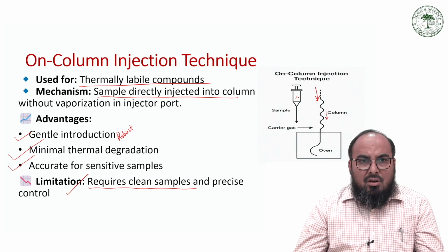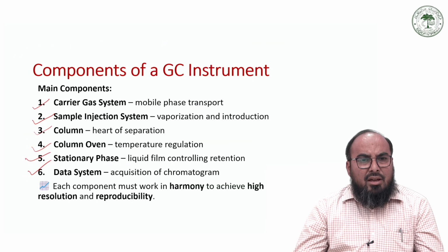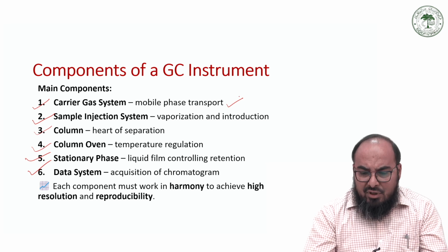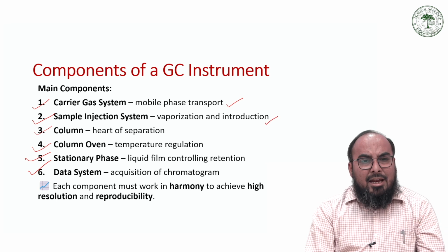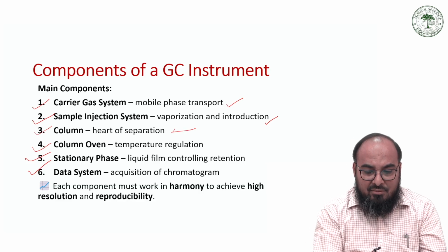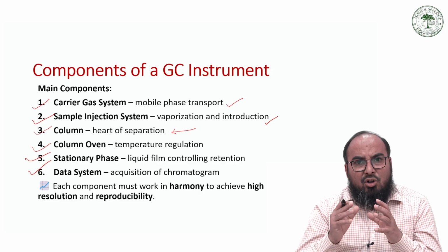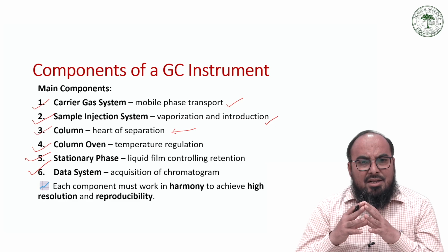Now, we have covered the carrier gas and the sample injection system, and now it's time to strike at the heart of the column. So we are going to study the different columns, which are of 2 types, in the coming slides.